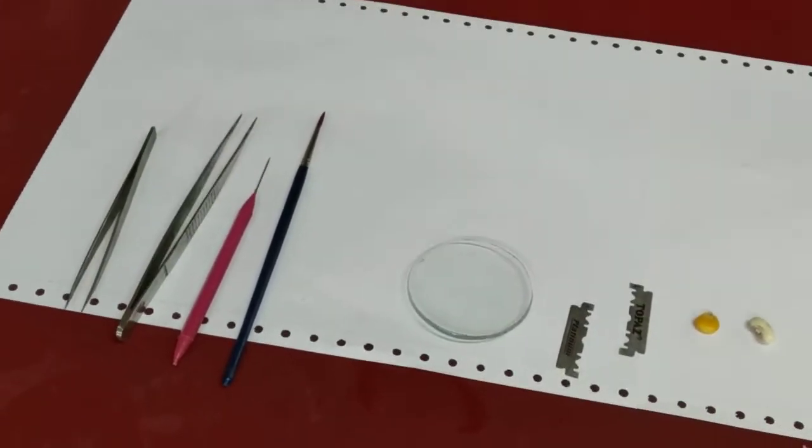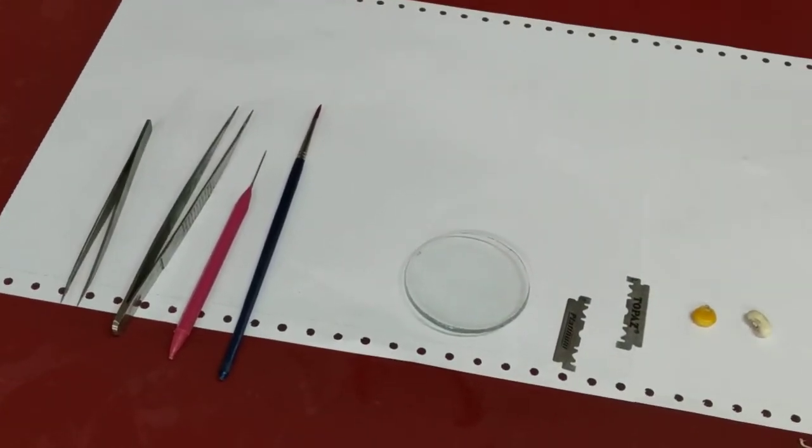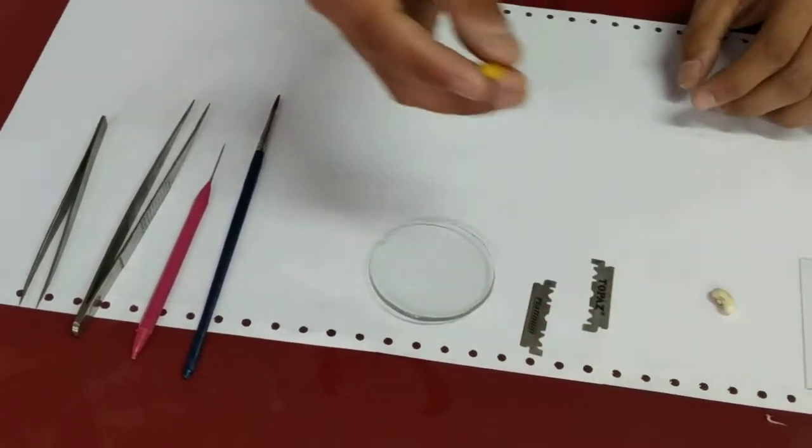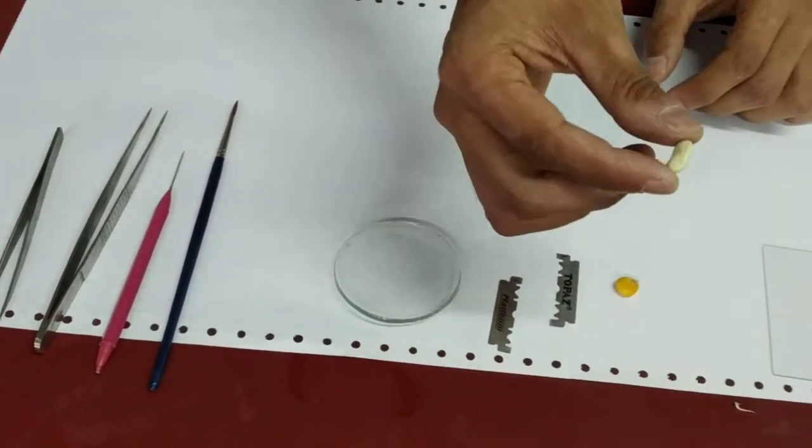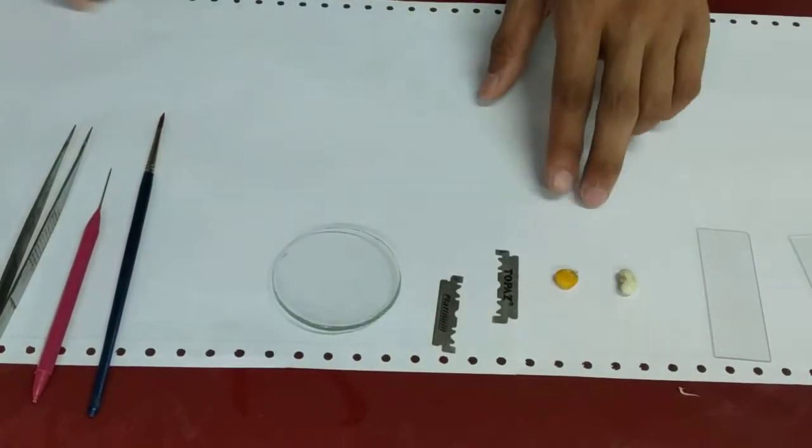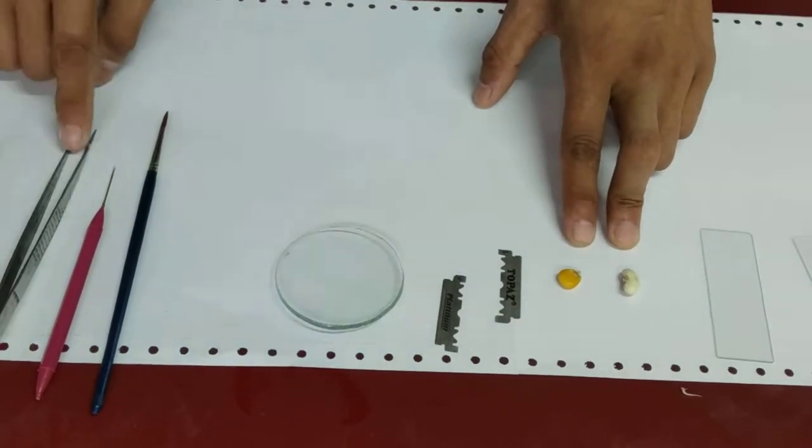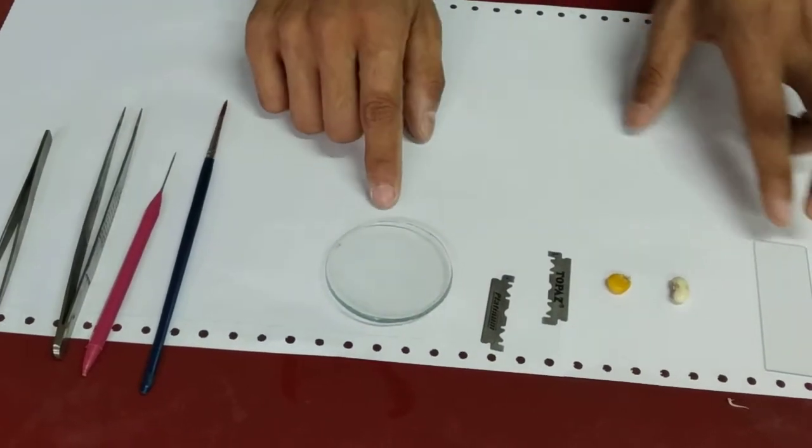In the preparation of permanent slides, the first thing you are going to need is the specimens. For monocot we are taking a maize and for dicot we are taking a bean seed. In addition to the two specimens you will require forceps, needle, brush or watch glass.